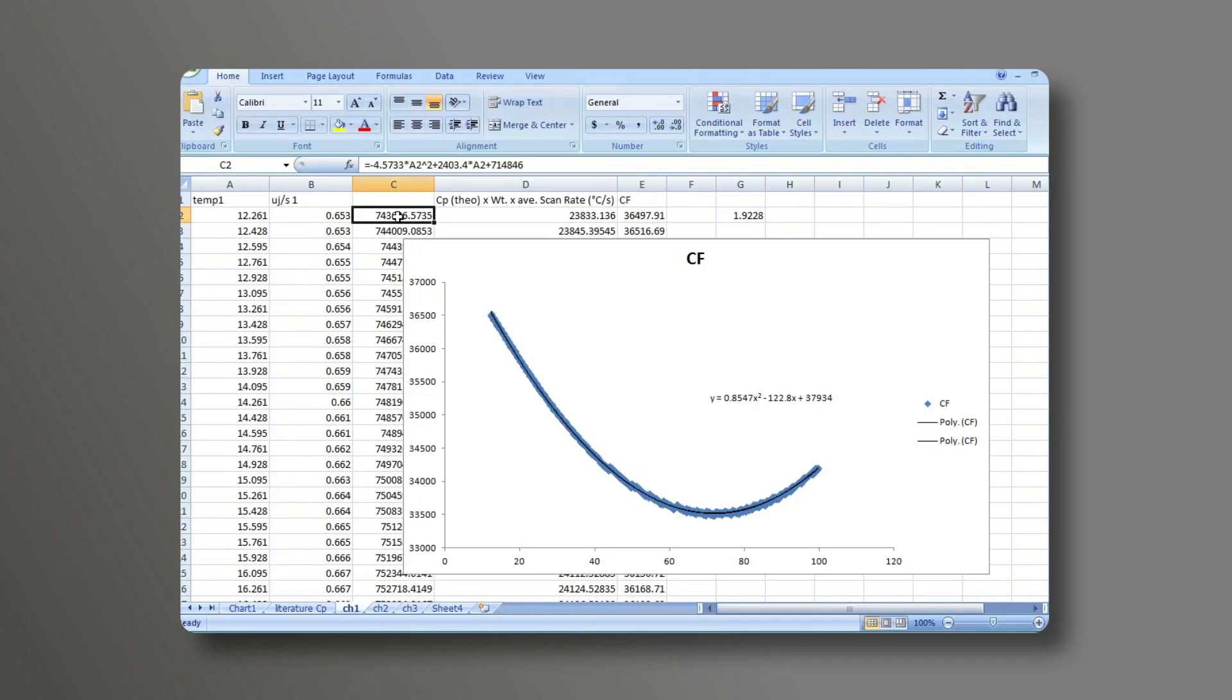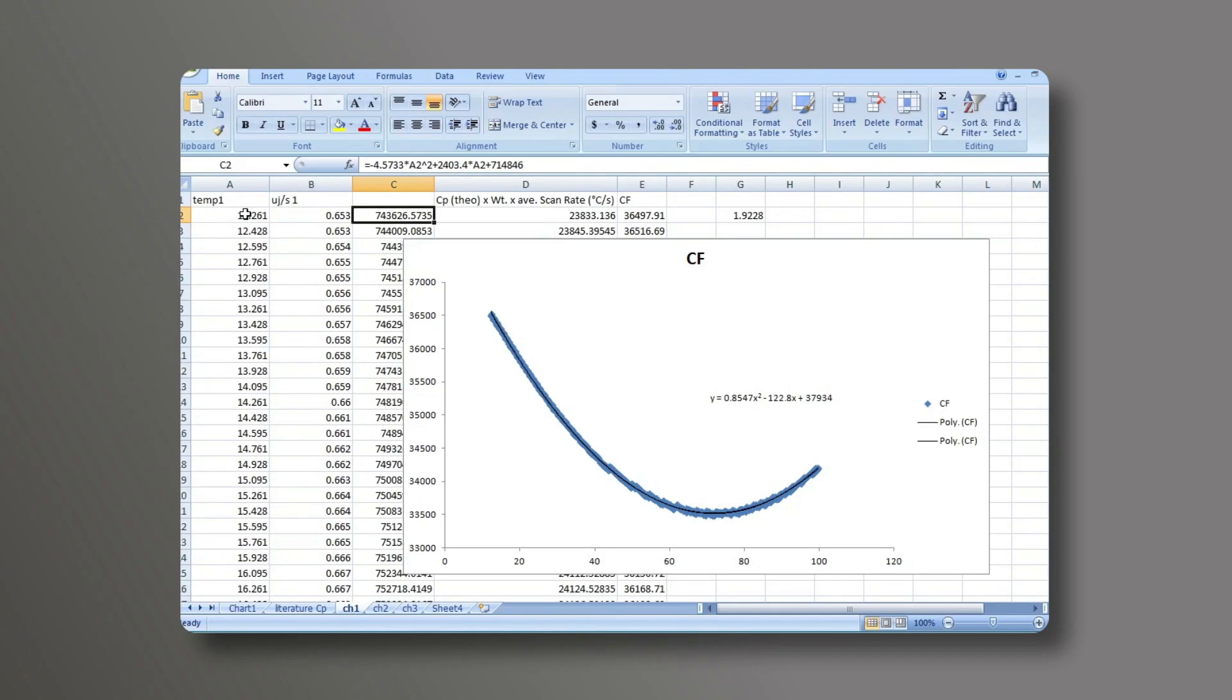In the third column, we have the equation that was determined using the theoretical heat capacity. So we have all of these coefficients that came from that fit of the second order polynomial. And then for the values that we put in for x, it's the temperature values that we actually used in this experiment.